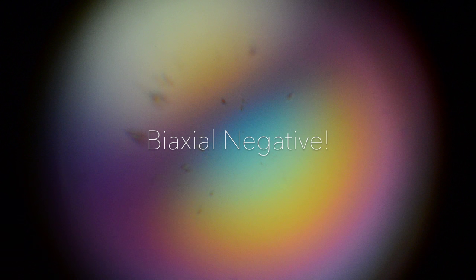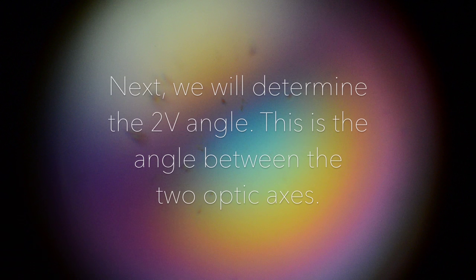This example is a biaxial negative mineral. Next we will determine the 2V angle. This is the angle between the two optic axes. We can determine the angle by examining the curvature of the isogyres.